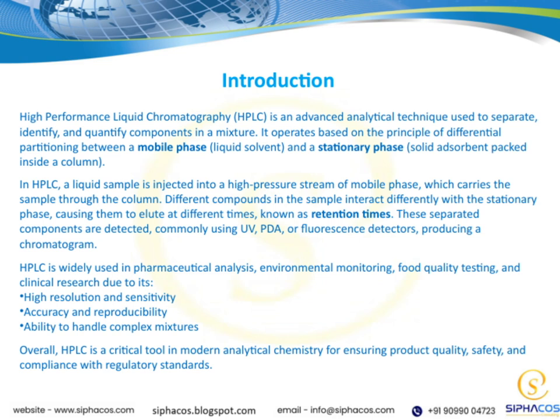Overall, HPLC has become a crucial tool in modern analytical chemistry. It helps ensure product quality, safety, and regulatory compliance, making it indispensable in many industries.